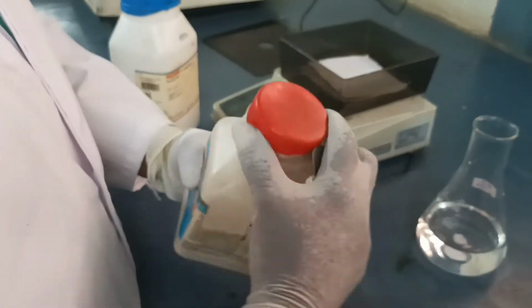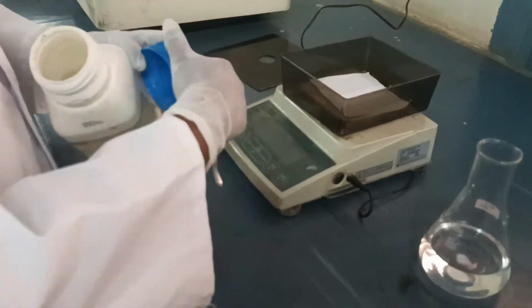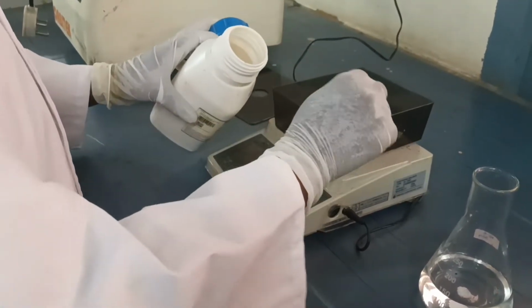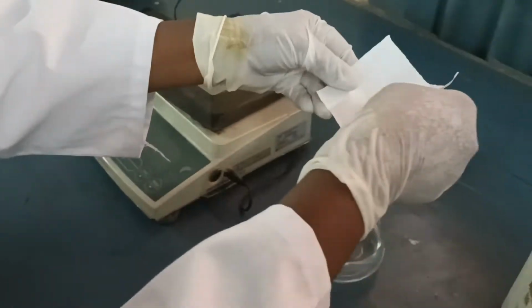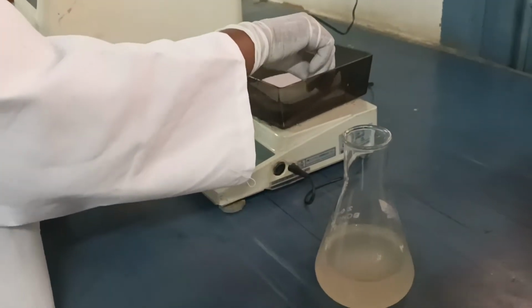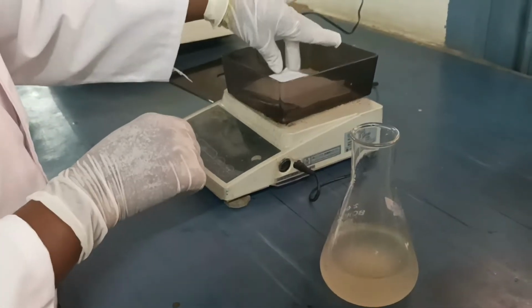0.5% peptone, 0.3% yeast extract, 1.5% agar, 0.5% NaCl. After mixing the ingredients, check the pH.